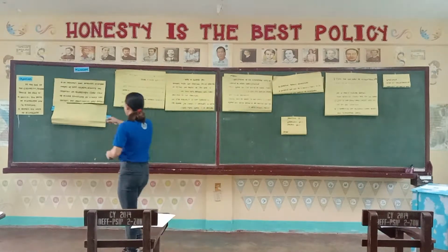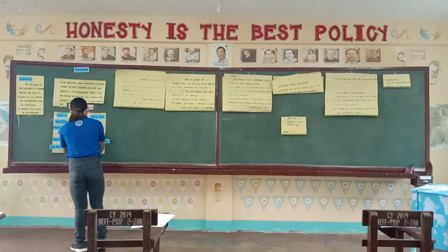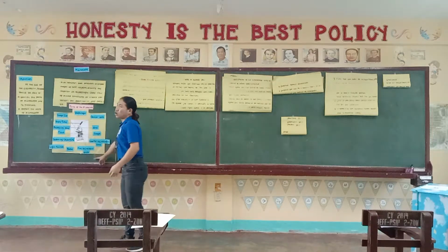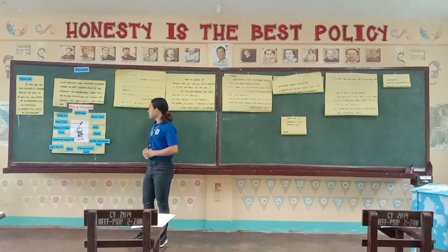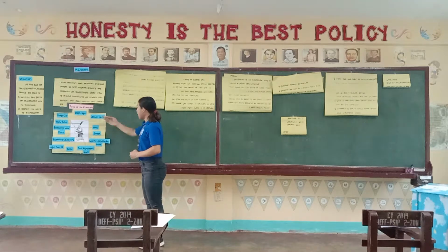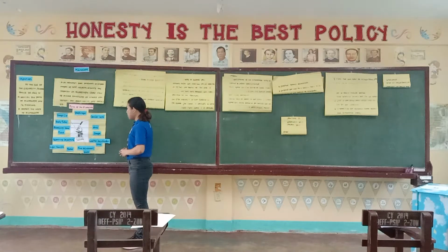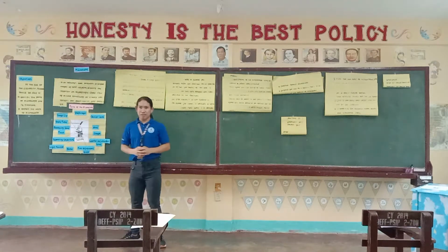Does anyone here know the different parts of a microscope? Okay, class. These are the different parts of a microscope. This is an illustration of a microscope. These are the parts. We have the diaphragm, the ocular lens, the arm, stage, coarse adjustment knob, the fine adjustment knob, the base, the light source, scanning objectives, revolving nose piece, body tube, and stage clip.